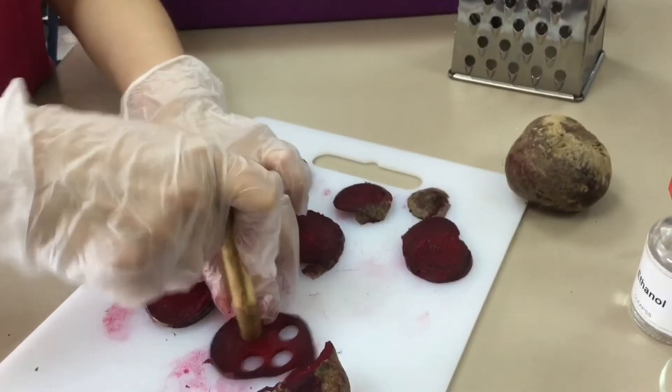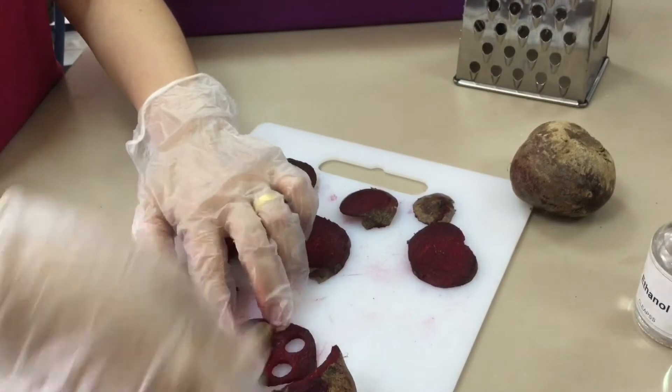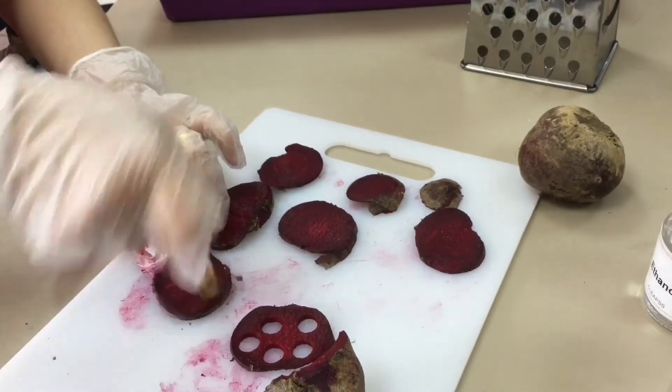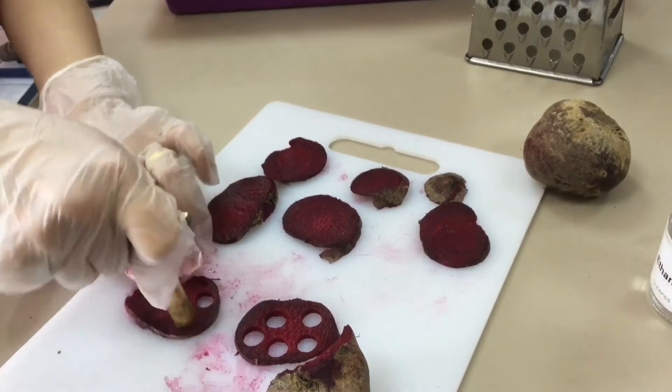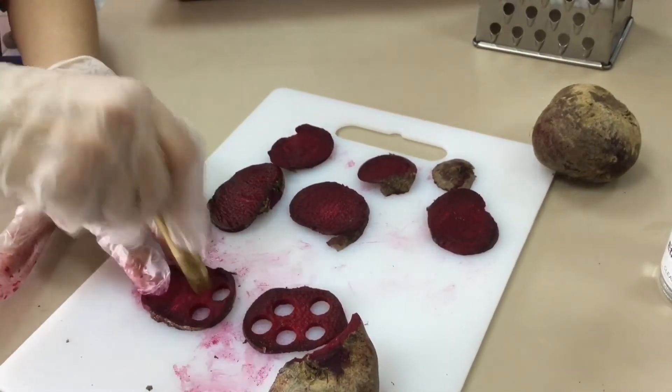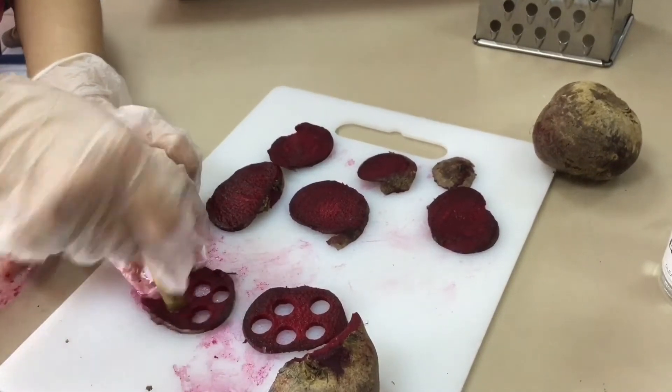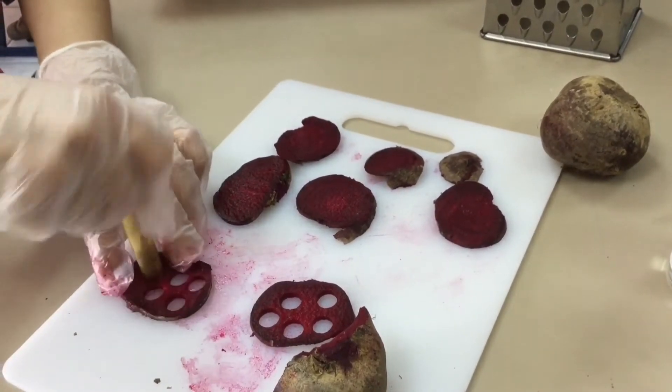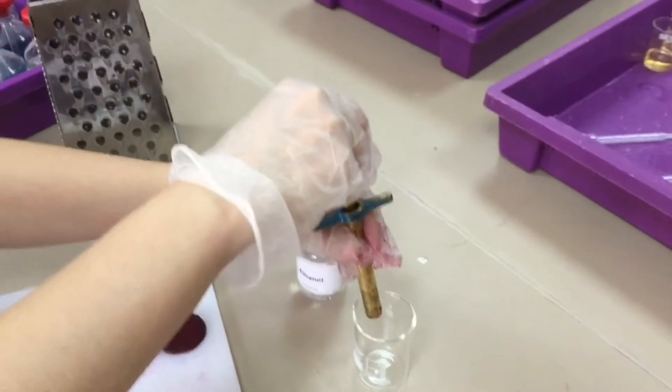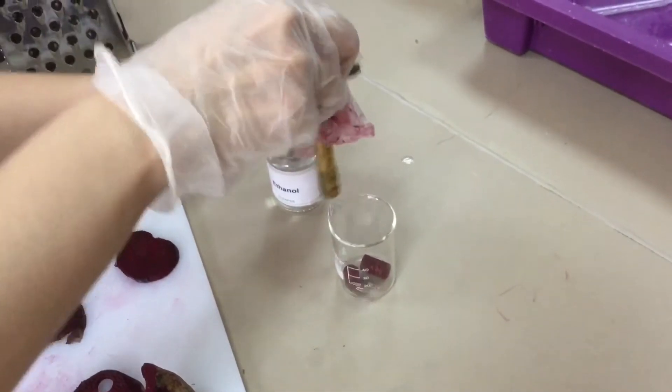To measure how permeable the cell surface membranes have become, we need to first of all produce a calibration curve and that's what I'm doing here. I've used a grater to produce standard thickness discs of the beetroot and I'm now using a cork borer to produce discs which will go into this beaker. I need to produce 20 discs.